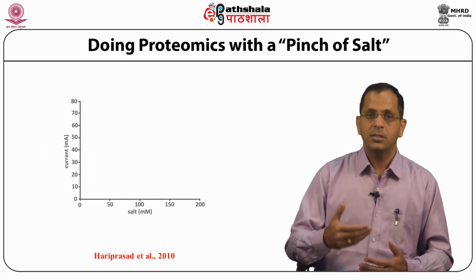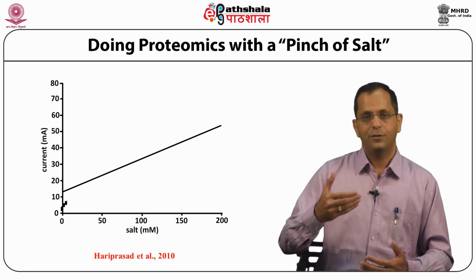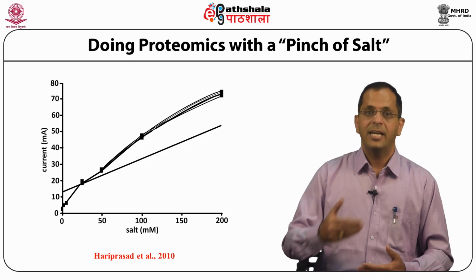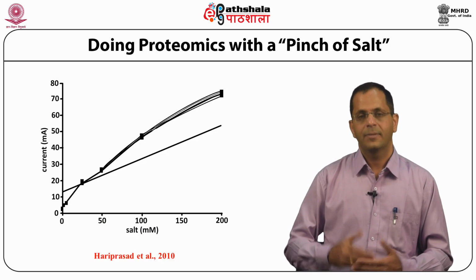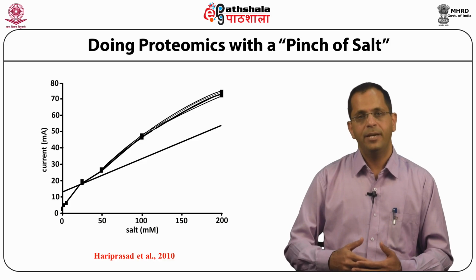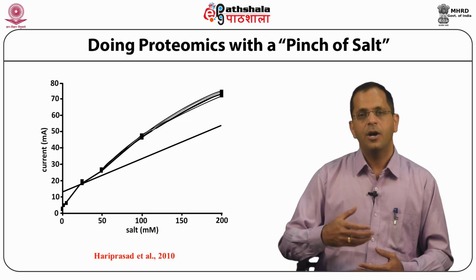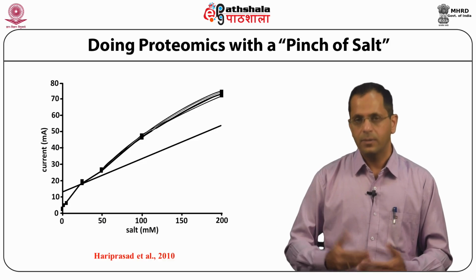The high costs involved in the consumables used in two-dimensional electrophoresis. And finally, understanding contamination is important because good separation can never be achieved with the contaminants. Now, having understood that you have salt contamination, you could take the sample and do dialysis, gel filtration or precipitation methods to remove these ionic contaminants.